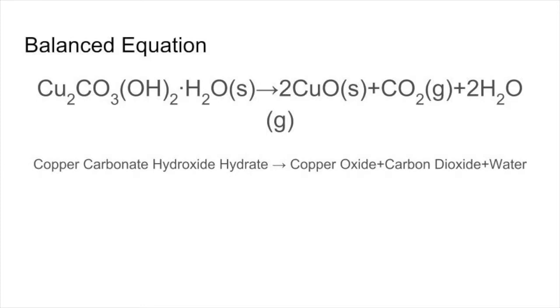After balancing the equation, we find that copper carbonate hydroxide hydrate will yield 2 moles of copper oxide, a solid, carbon dioxide, a gas, and 2 moles of water, also a gas.